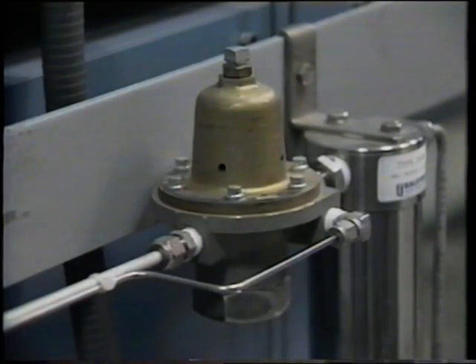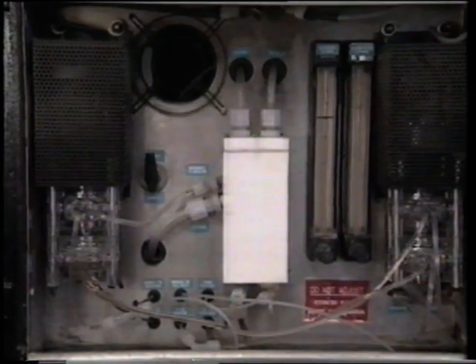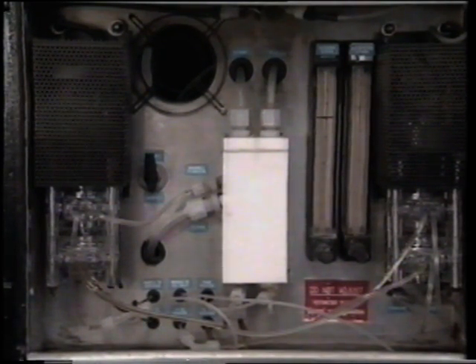Gas chromatograph analyzers require very consistent and specific pressure levels to provide accurate analysis. This sample conditioning system maintains and controls this pressure. Normally, the sample is driven by process pressure. Sample pumps can be used to drive the sample if process pressure is not suitable. However, their use is not recommended because they tend to detract from system reliability and need a lot of maintenance.